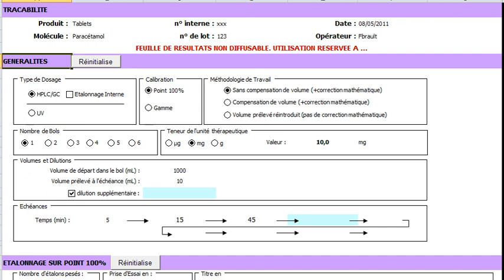Here we could select the further dilution of the aliquot, but this is optional. Here we enter the terms of the kinetics. The form accepts up to 9 terms, but it can be customized, as well as all the other parts of the form.